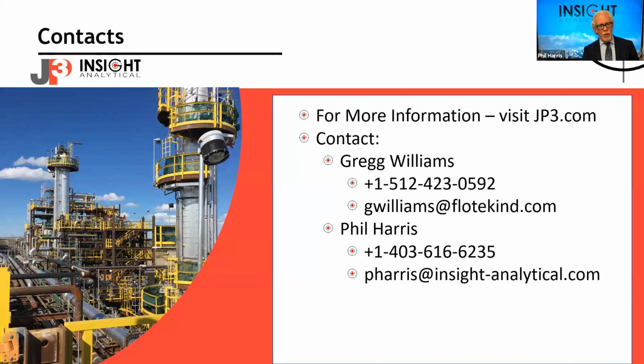One of the things we were really interested in was liquids analysis, like crude oils, condensates, LPGs. The absorption bands in the mid-infrared are a lot stronger, and so you end up having to go to shorter and shorter path length cells. Now when you start thinking about, say, a natural gas condensate off of an inlet stabilizer or crude oil straight from a wellhead, it's dirty.